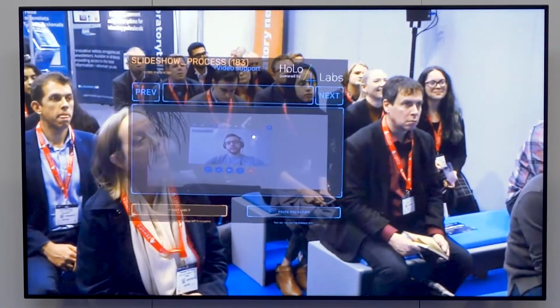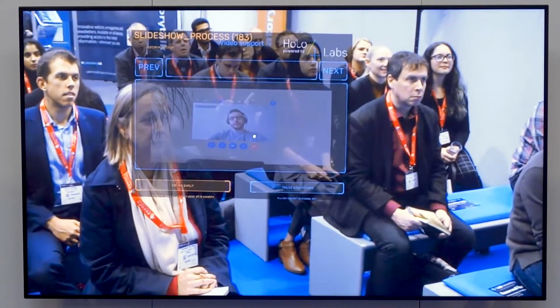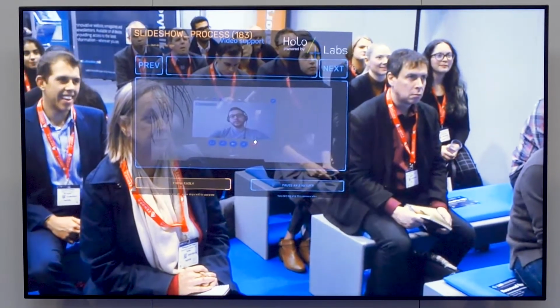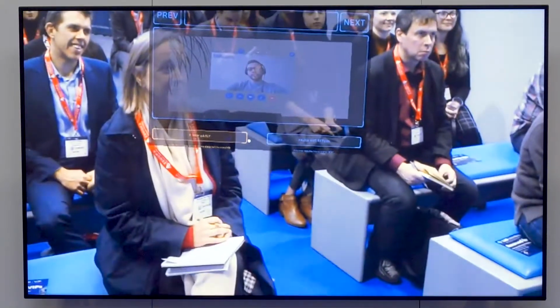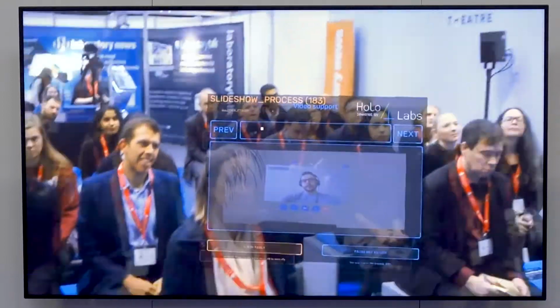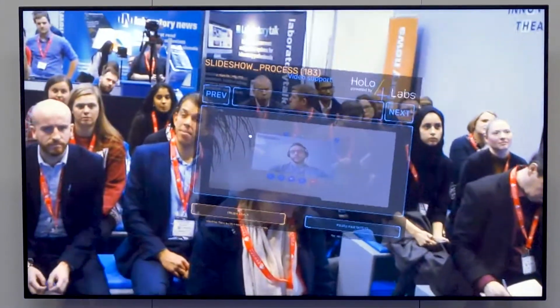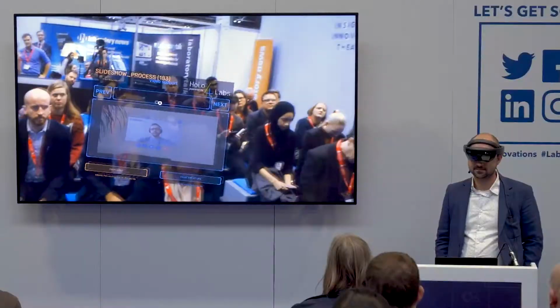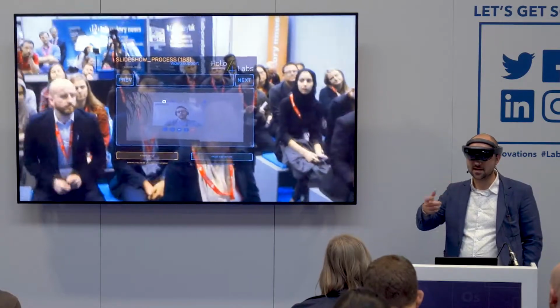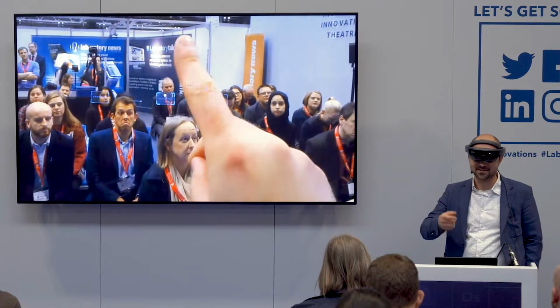Sebastian. See you. So again, you can manipulate the picture you can see, so the person that is remote to you can draw on your view. So if I go around here, the drawings of the person will be stuck to the place where he put them. We have some latency, so I'm seeing some pictures before you are seeing them.